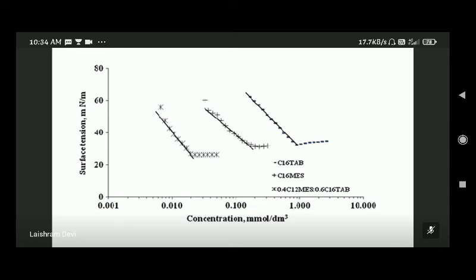That's why we try our level best to give you a very dilute solution. But even though you're given a very dilute solution, it will create lots of difference. It will create a large decrease in your surface tension value. So it doesn't matter, right? What you will do is start from the most dilute concentration.